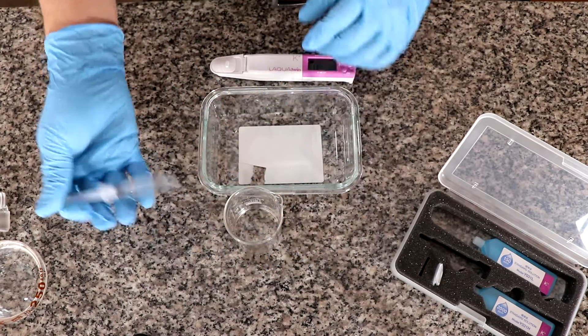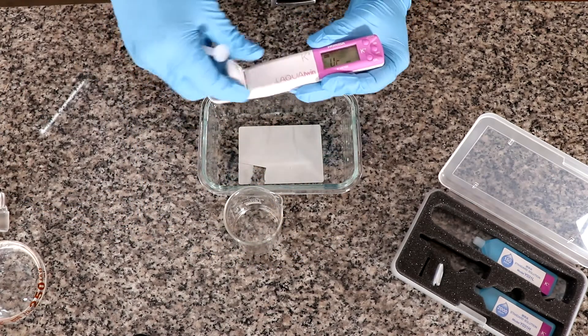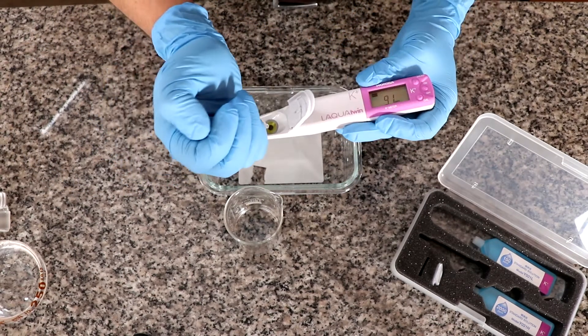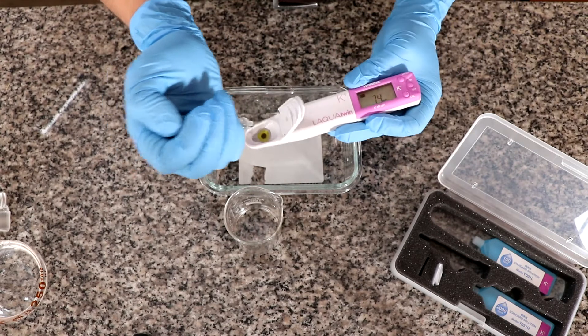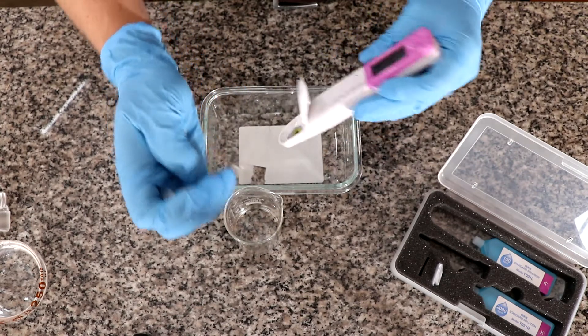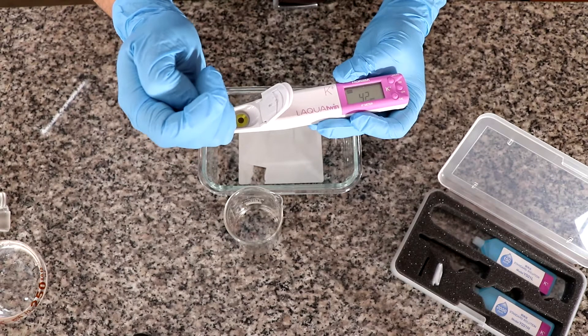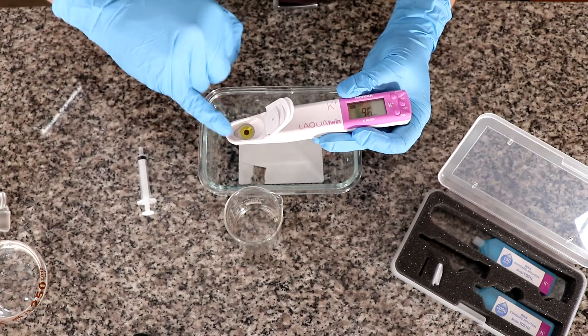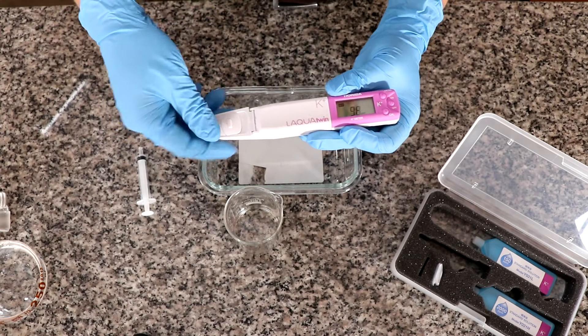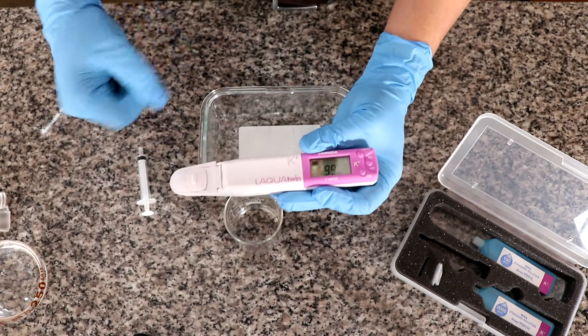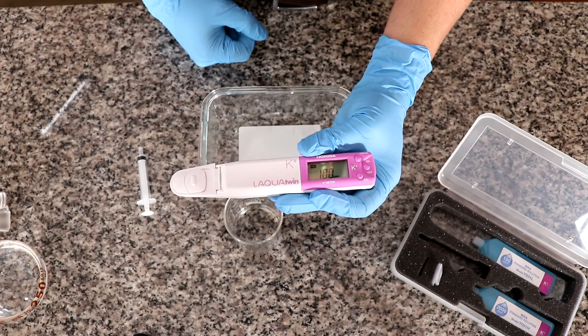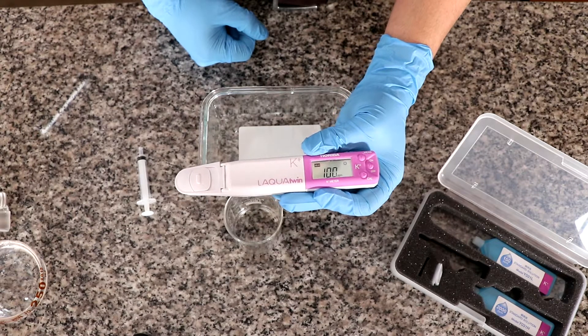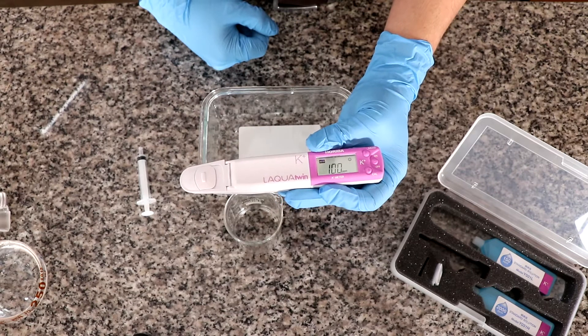Now using the solution, I am going to do the same thing that we did with the calibration solution, where I'm going to dump three times. And then this is the one. Make sure you fully cover the area of the sensor. Now we should wait. This is telling us we have 100 ppm of potassium.